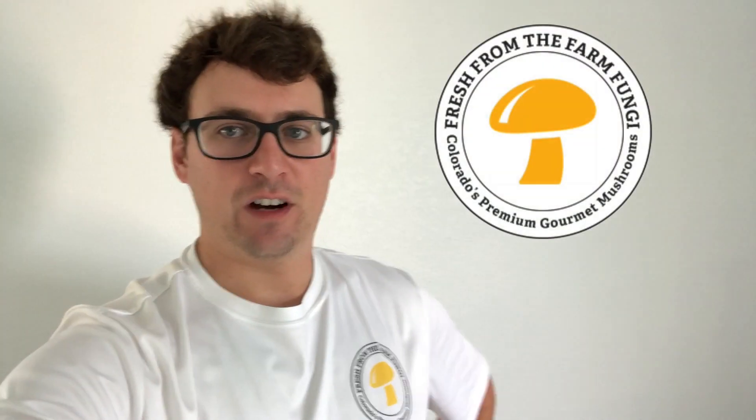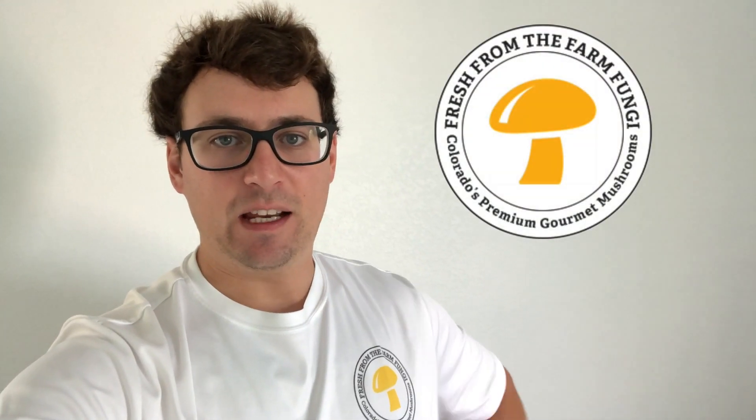What's up guys, it's Gary with Fresh From the Farm Fungi. I'm here in Denver, Colorado and I wanted to do the six-week update on the cordyceps breeding project. We've got our top five selections and I made two different types of broth, so we're gonna be doing comparisons in honey water, which is what I usually use for all my saprobes.